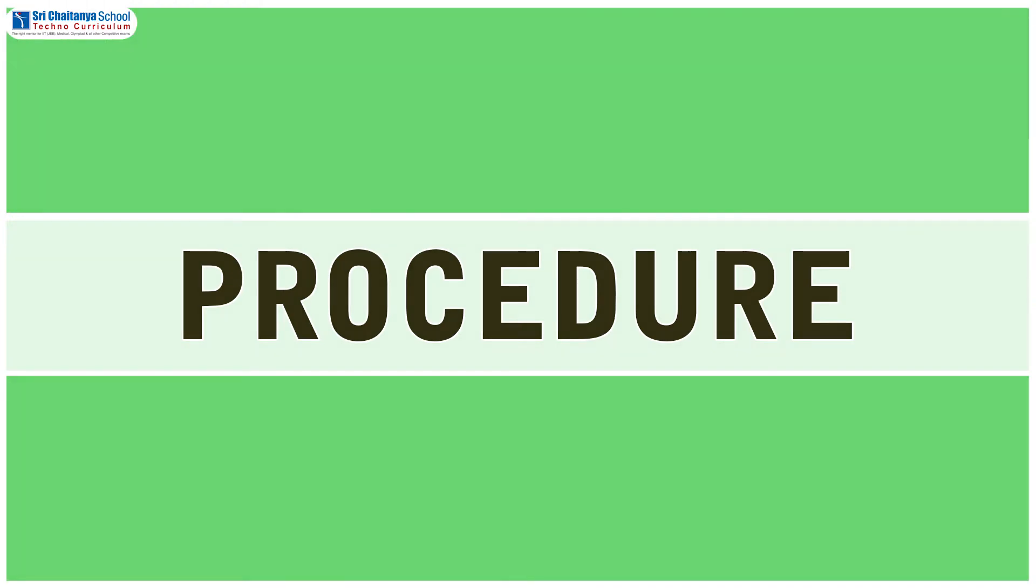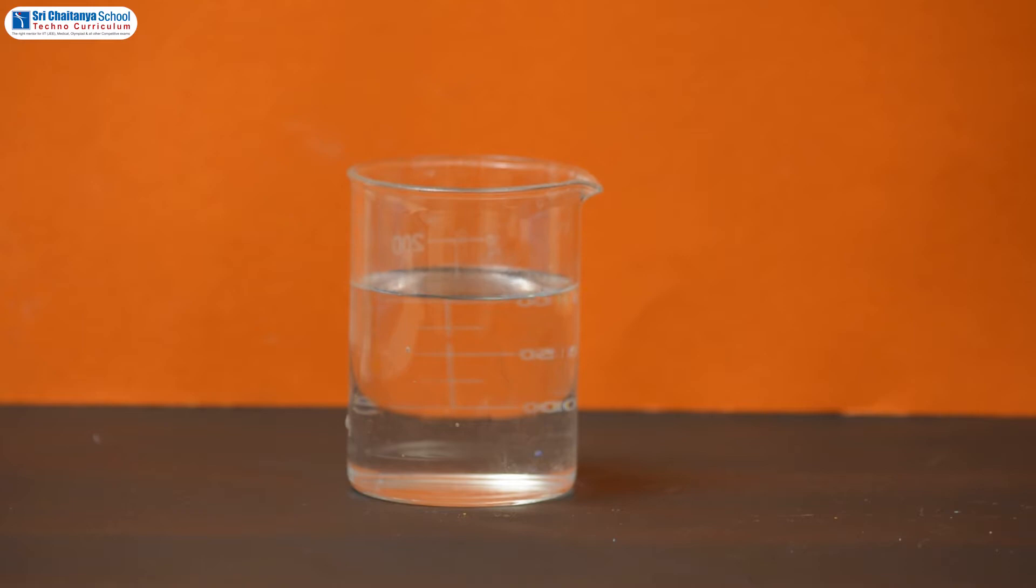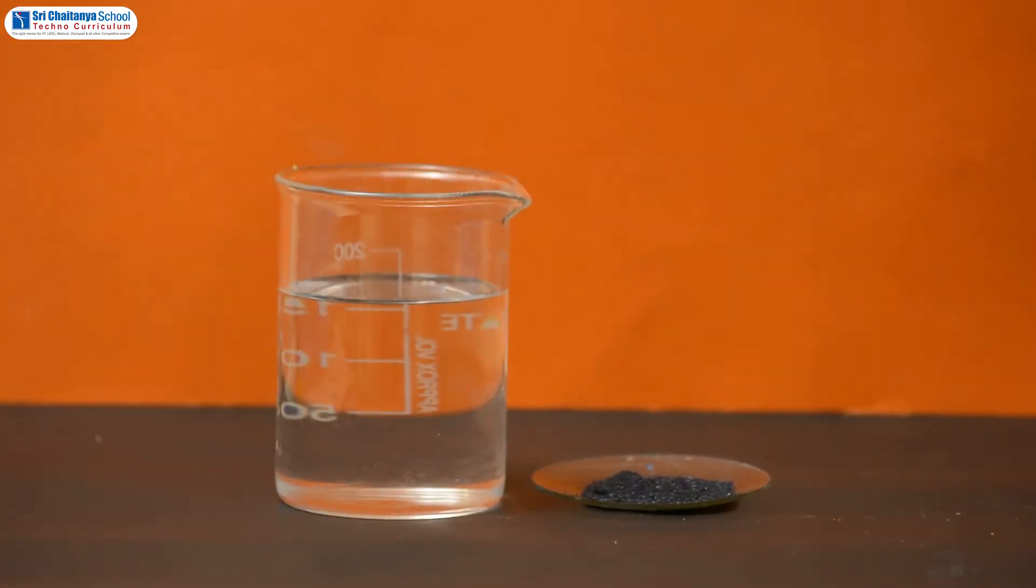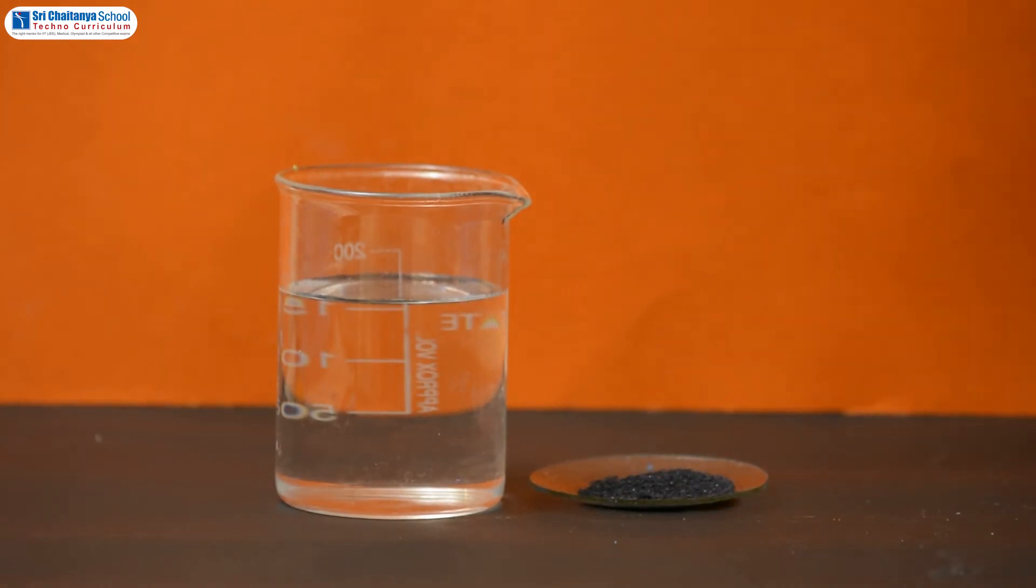Now it is time to see the procedure. Take a beaker with clean water. Now add a pinch of crystals of potassium permanganate and dissolve them thoroughly.